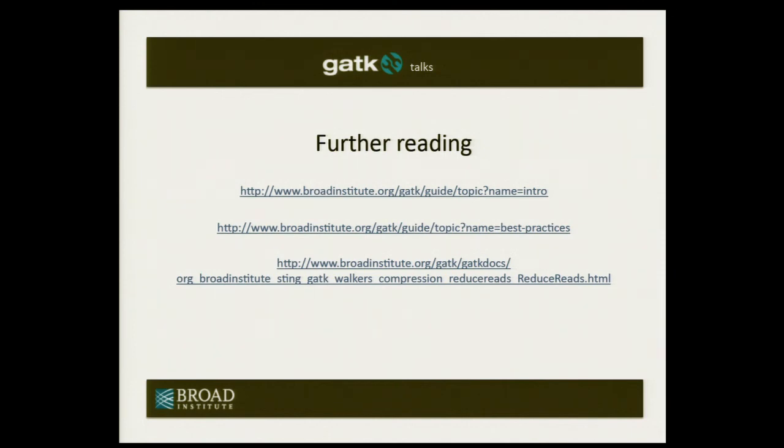This is going to come up tomorrow in the variant quality score recalibration talk. We have done extensive analysis to make sure that reducing the BAM wouldn't impact the filters and all of the annotations that we make on that metadata. And it really worked very well for everything that we've done so far.